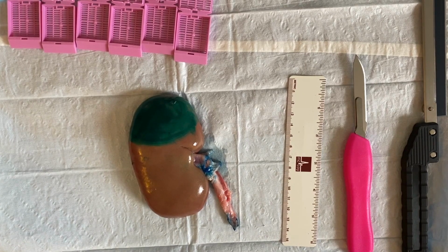Hello, this is Roseann Vitale, and I am going to be reviewing how to do a prosection of a kidney specimen. What we have here is a pig kidney, which I have previously inked for your orientation purposes.